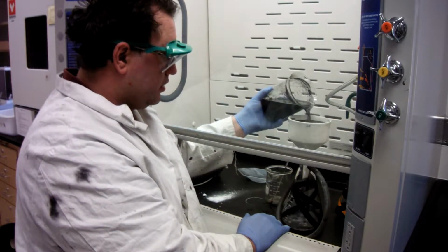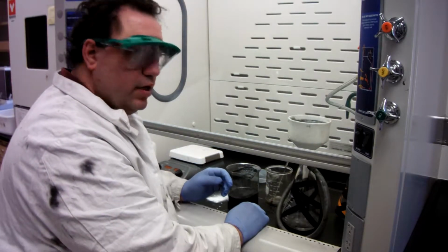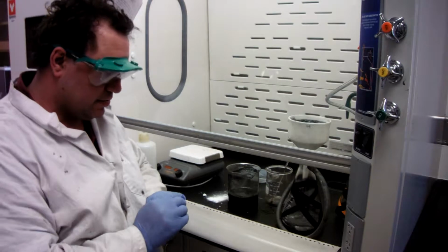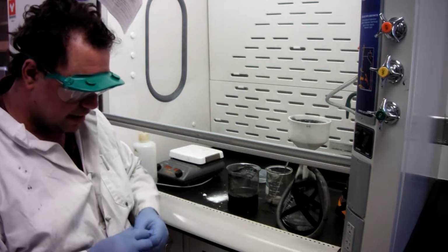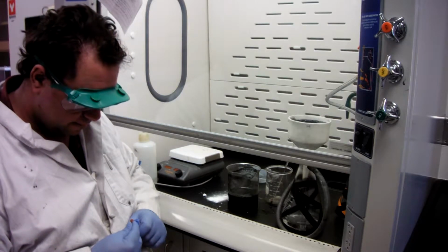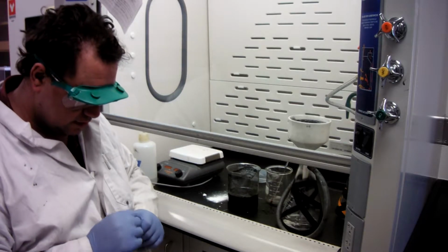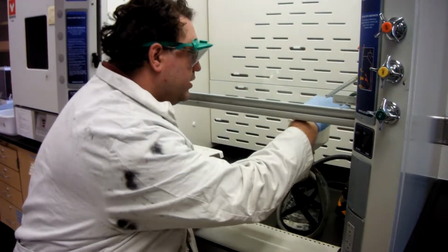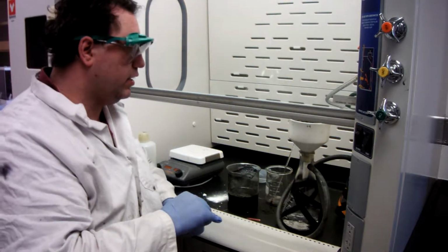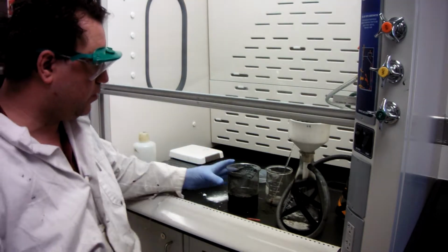Make sure you're wearing gloves while doing this, and goggles. Now, this takes a little while to filter, but each time you filter, we do this. After we filter many times, we should be able to take one of these pH papers and stick it in to find neutrality. So let's see, right now it's pretty acidic, really red. So we're going to pour DI water through until we don't get the red line anymore, which might take quite a bit of DI water.